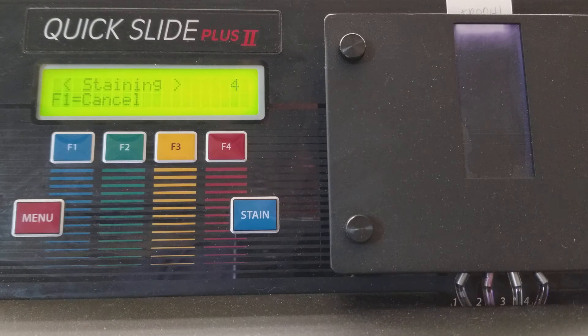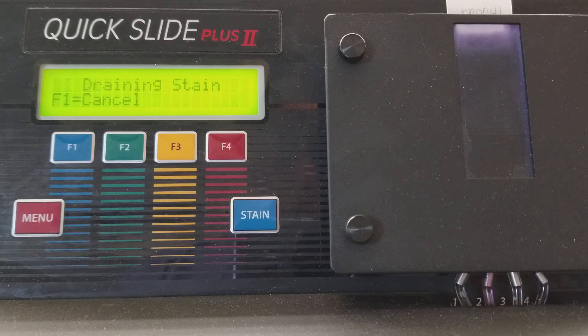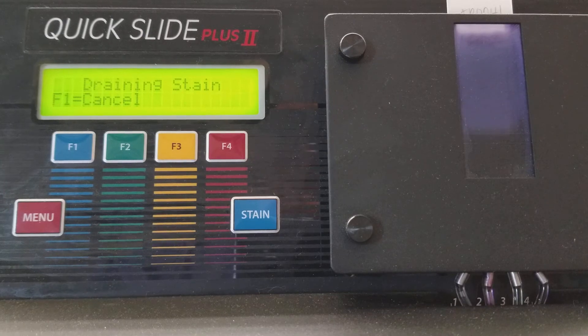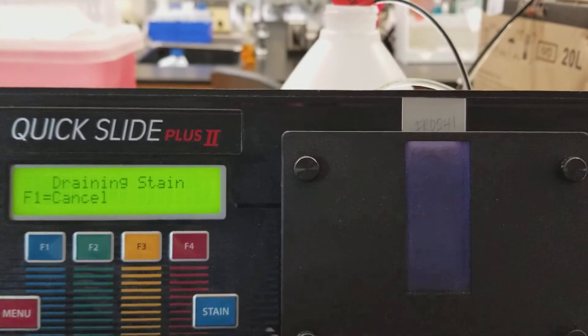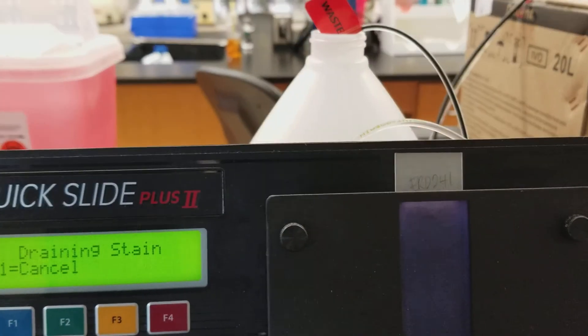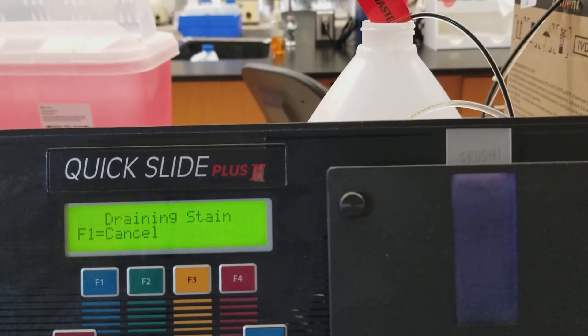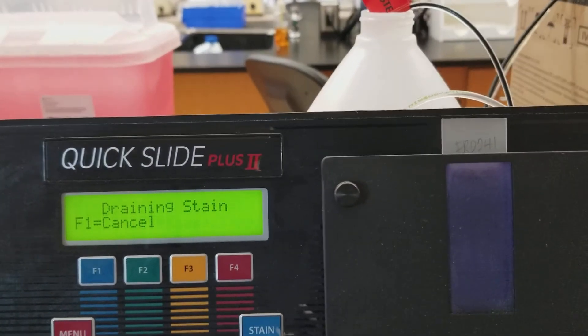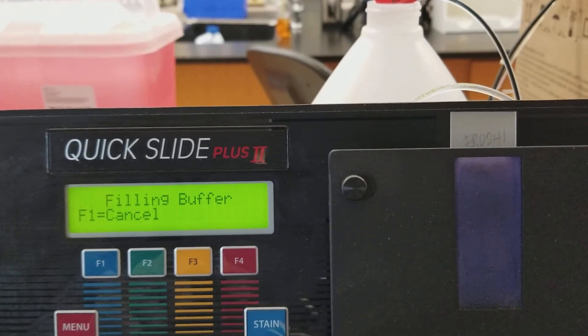So we're at the end of the stain. Then it's going to drain the stain. Like I said, it goes back. See how it's going into the waste back here? Very cool.